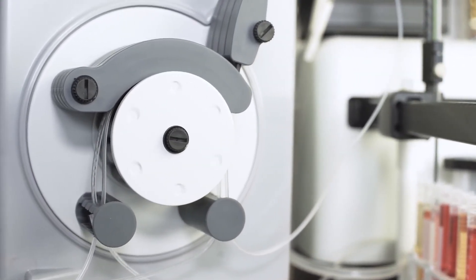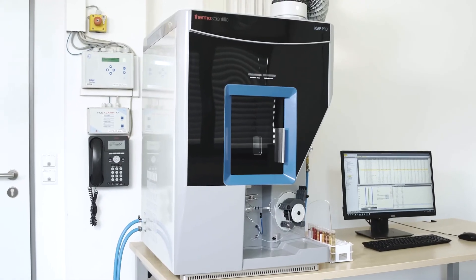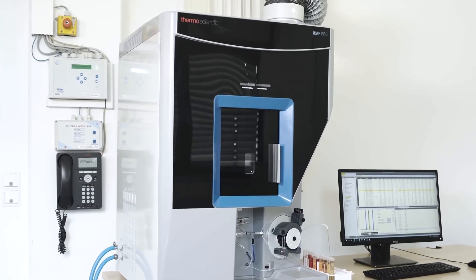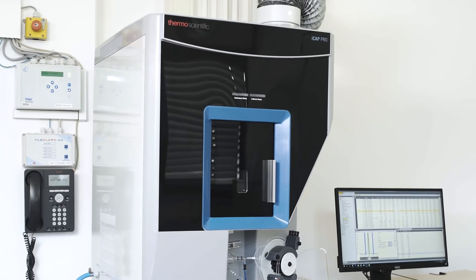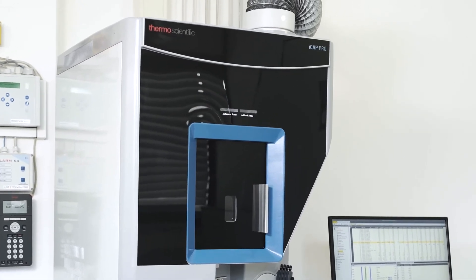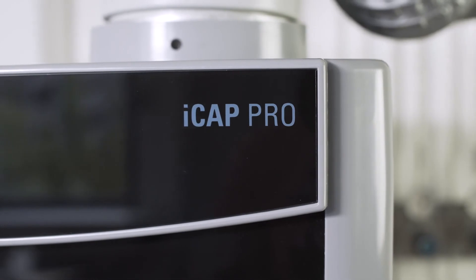The iCAP Pro ICP-OES is the next generation solution for trace elemental analysis performance. Perform like a pro and win the race in trace elemental analysis.